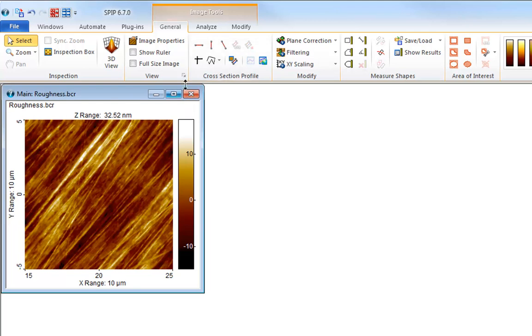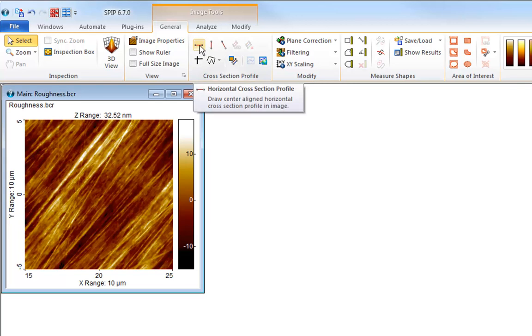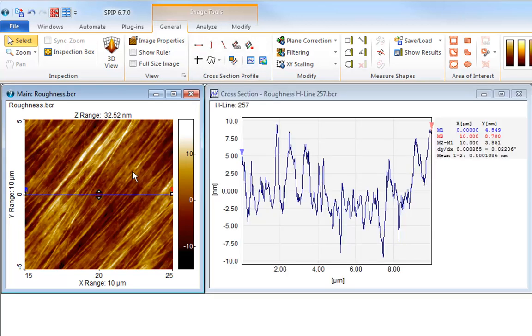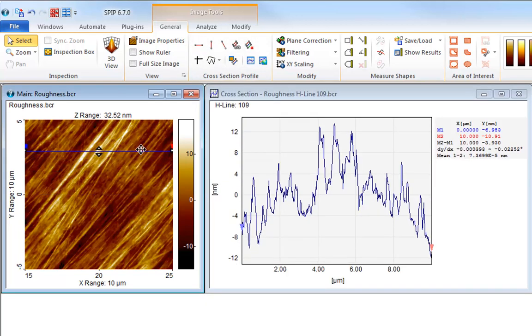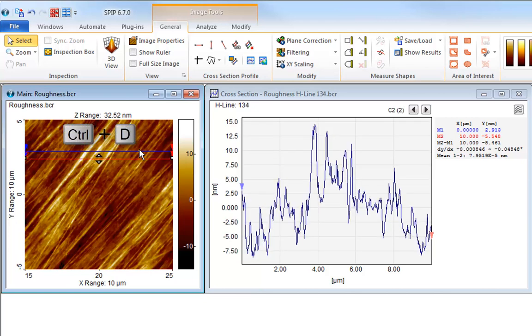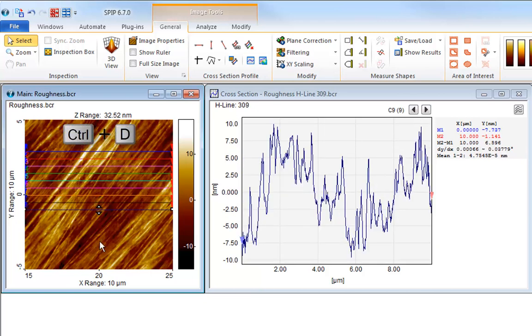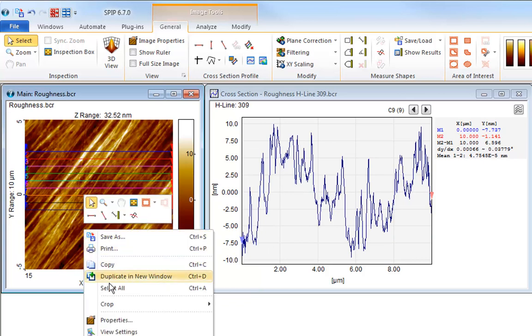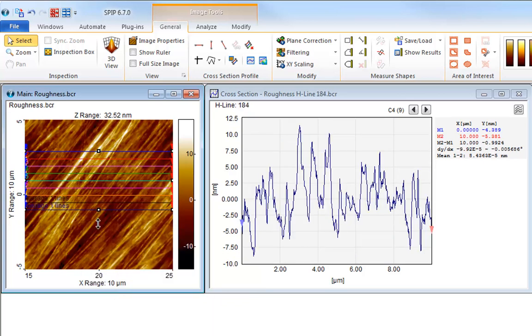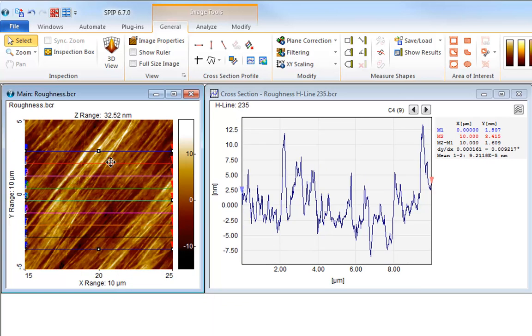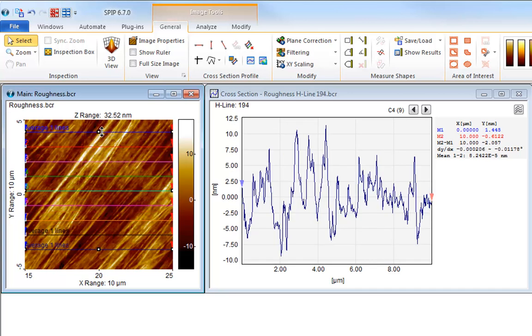For quickly drawing many identical cross-section profiles, just draw one and then duplicate the profile multiple times by repeatedly pushing Ctrl-D on the keyboard. Afterwards, you can select all profiles by Ctrl-A and adjust their positions collectively, maintaining the same relative distance between them.